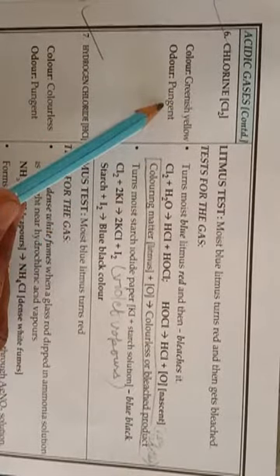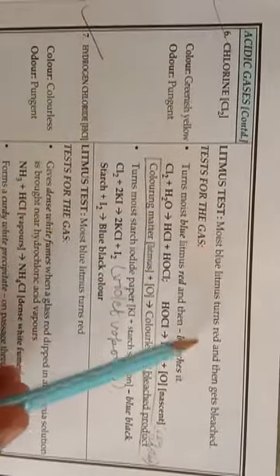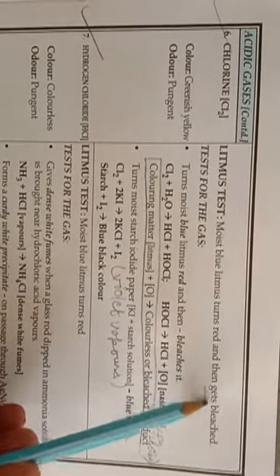The next acidic gas is chlorine. Chlorine is a greenish yellow gas with a pungent odor. Moist blue litmus turns red and then gets bleached.